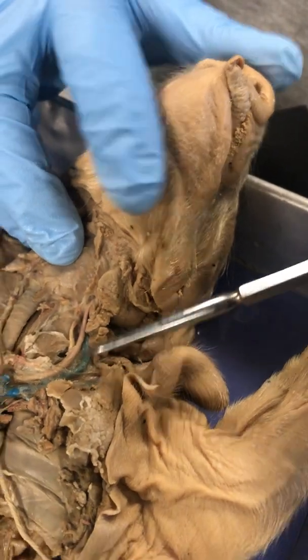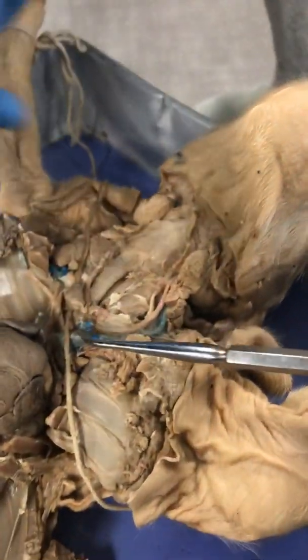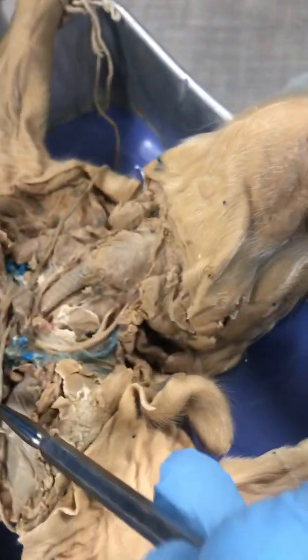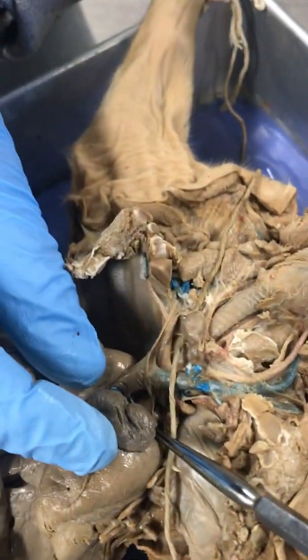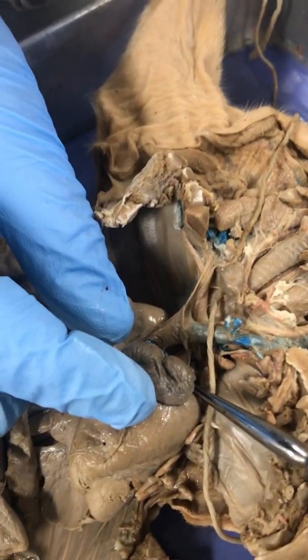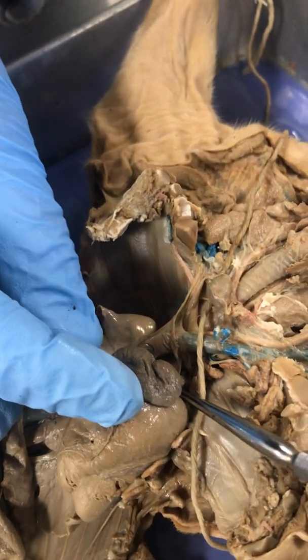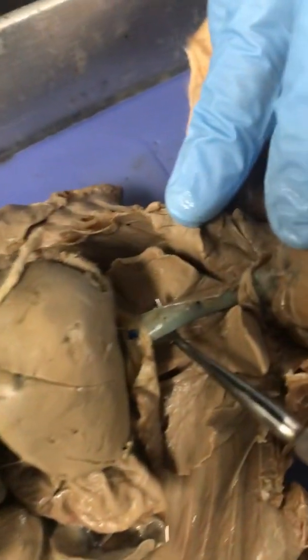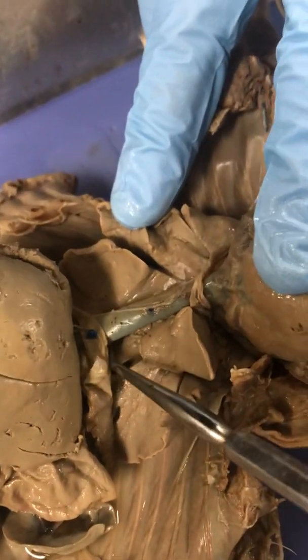Now, all this blood is returning from the head, and eventually it will enter what is called the anterior vena cava. That would be equivalent to the superior vena cava in humans. Then the inferior vena cava would be right there. It's really big on this one. Yeah, it's a pretty good size, well injected.